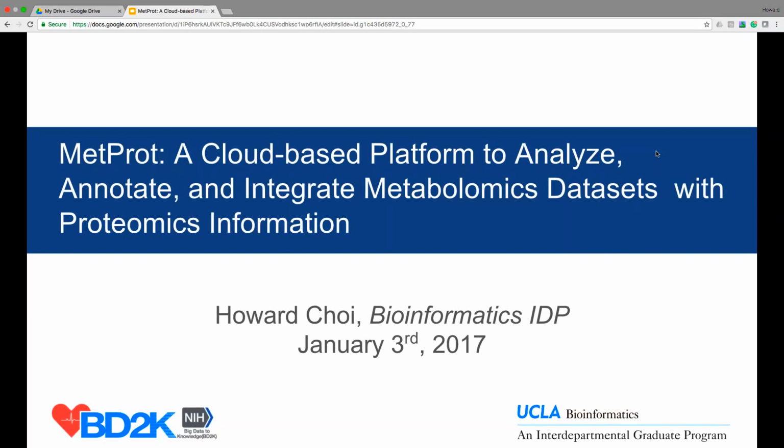I'm Choi from UCLA. Today I'm going to talk about a new project, MetProt, which is a cloud-based platform that analyzes, annotates, and integrates two omics, metabolomics and proteomics. This is a relatively recently launched project, so in today's presentation, I will mainly go over the specific aims of the project as well as our approaches. And at the end of this presentation, I will show a quick demo.